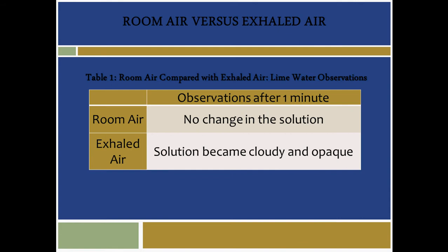As expected, the lime water beaker with room air did not turn cloudy. After bubbling room air through the solution for another minute, no change was recorded. The lime water beaker with exhaled air did turn cloudy and opaque after 1 minute. Table 1 shows the observations for each condition.